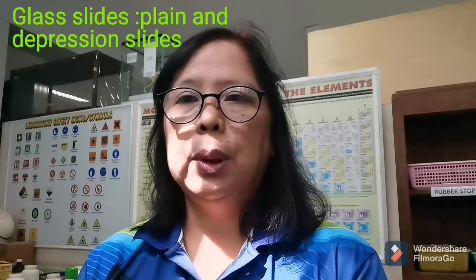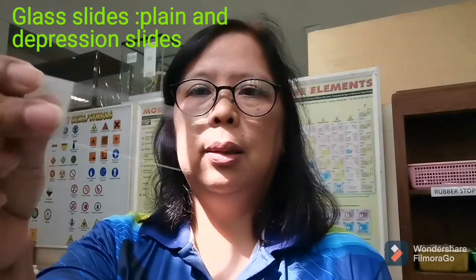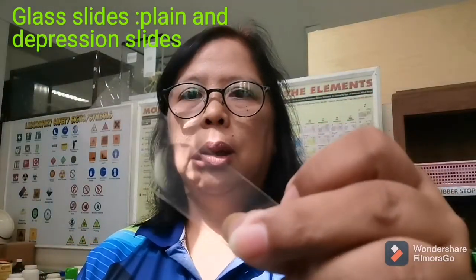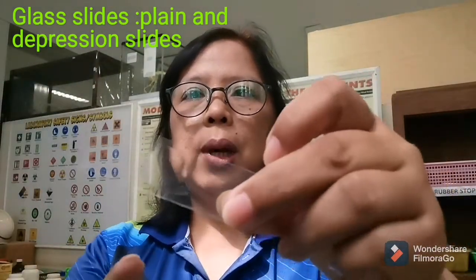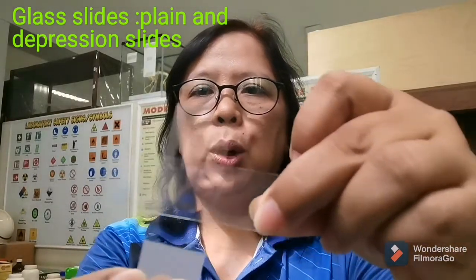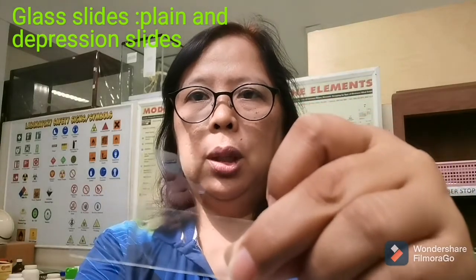And in this experiment, we will be using two kinds of slide, the plain glass slide and also the depression slide. Their main difference, if you look at the intersection of the two slides, you have there a circle that is actually a depression. Okay? And then, of course, we are going to make use of the alcohol lamp.